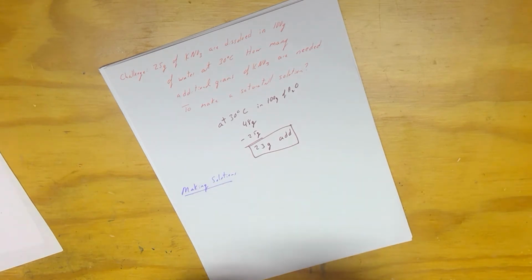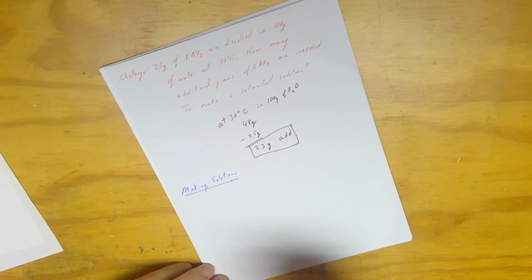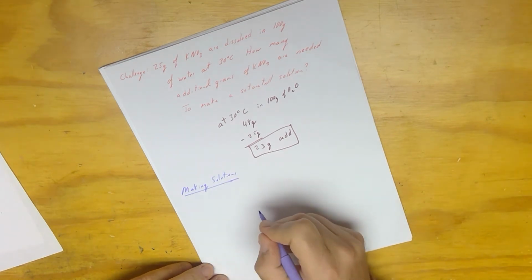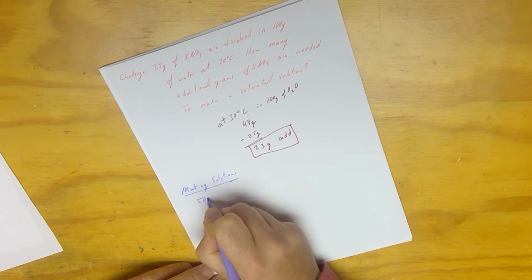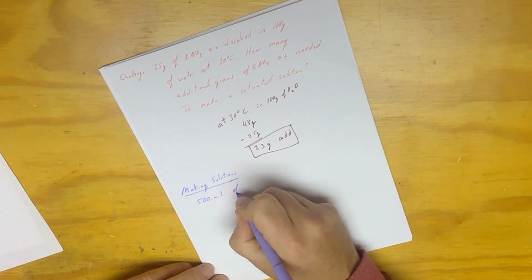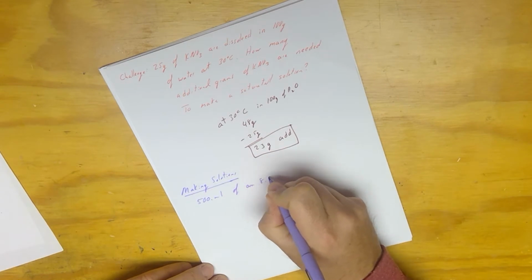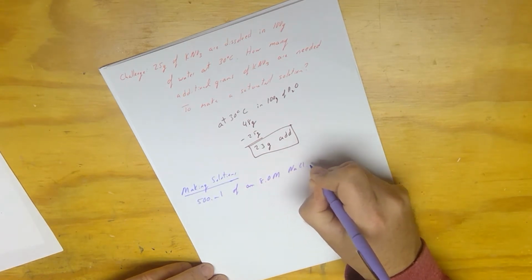Okay. So what I'm going to do is take you through what I have to do. All right, so let's say that for a lab I need 500 milliliters of an 8.0 molar NaCl solution.